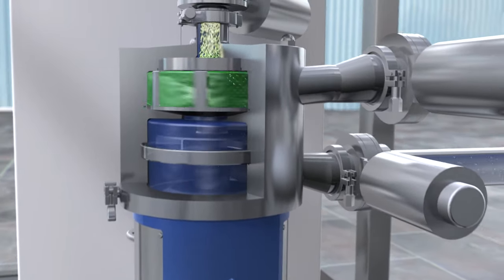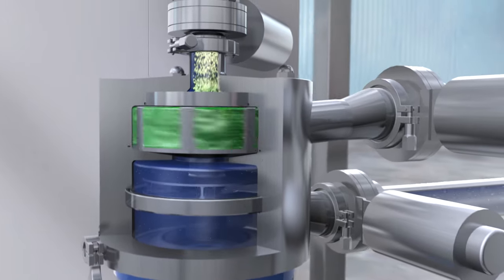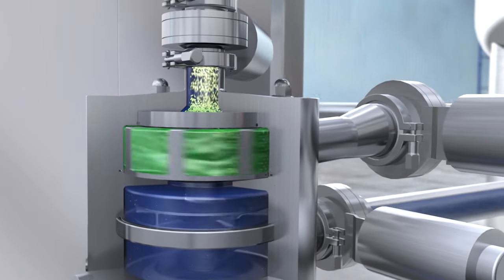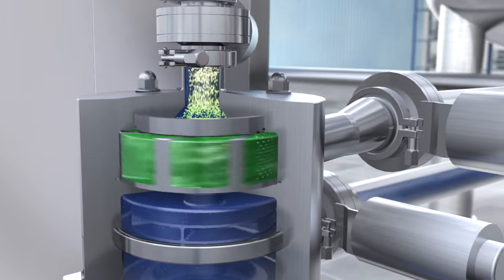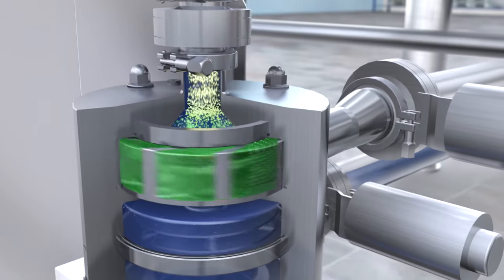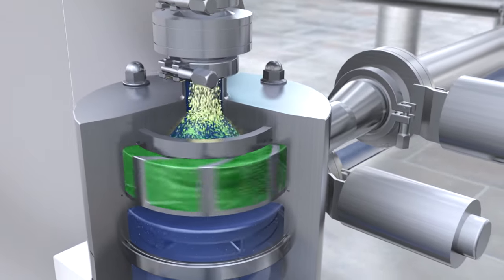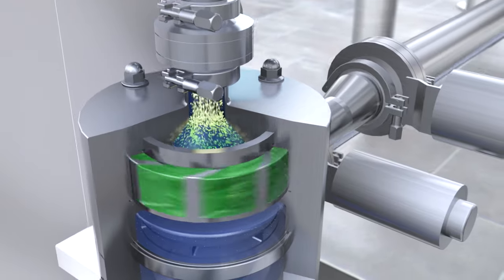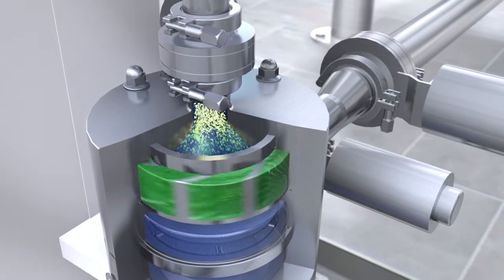The liquid enters the machine from the bottom. The pumping rotor conveys it to the dispersing stage and the solids are drawn from the hopper into the mixing chamber. In a few fractions of a second, the solids are mixed with the liquid phase and dispersed.